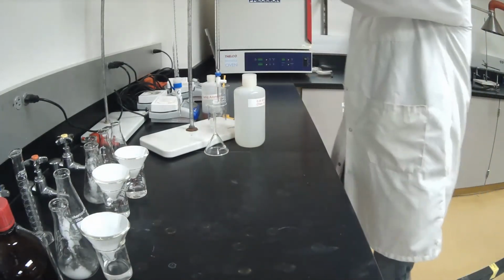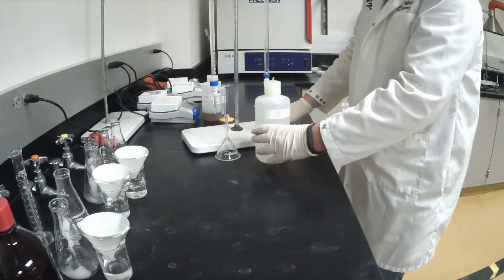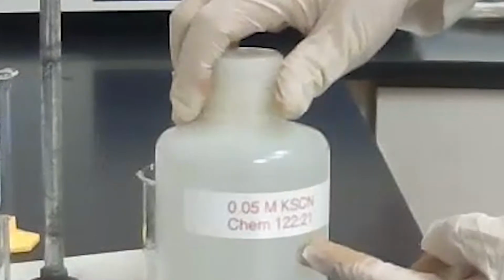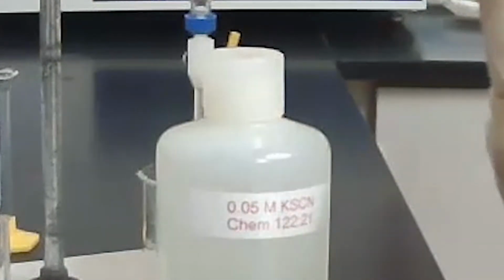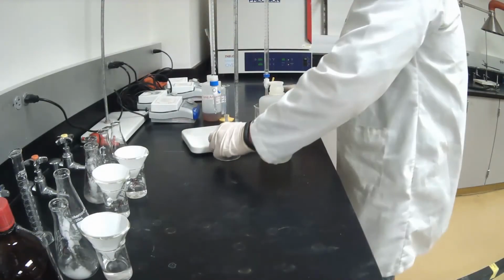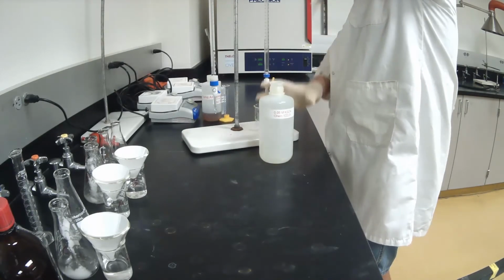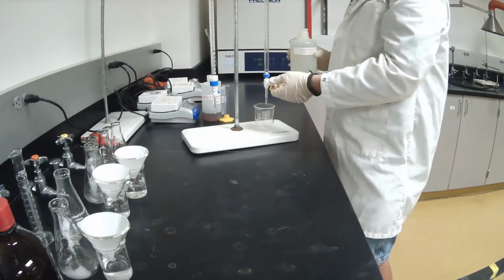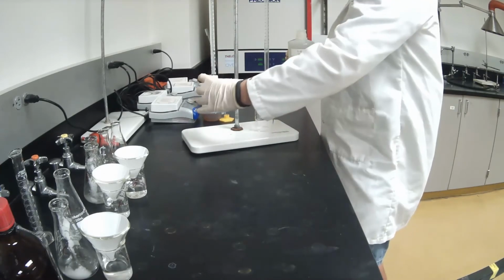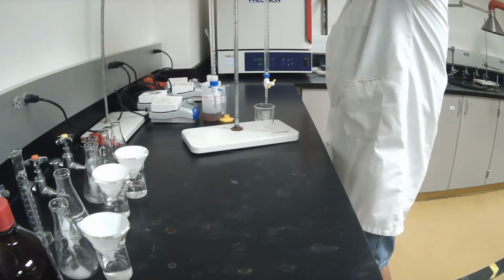All right, so now we have our burettes over here, and we need to rinse them with our titrant, which is 0.05 molar potassium thiocyanate. See, that's why you wear gloves. So first we're going to just put a little bit in here just to rinse the insides. I've turned the stopcocks here just so that they'll collect a bit on the bottom of each burette.